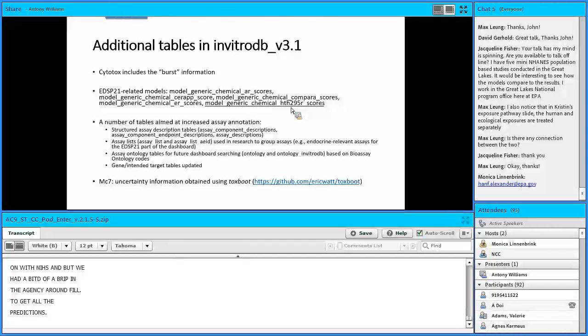And then finally, Tony mentioned searching for assays based on annotated gene. Again, Mahmoud Chaber and my team, very tedious and time-consuming work to sit there and hand annotate genes to assay endpoints, but that has been updated a lot. And I think it helps to have it in the database because if you're doing a bioinformatic integration of ToxCast assay data with Affymetrix data or data that you've pulled out of PubMed of any kind, you might use gene name as an identifier to integrate those data streams. And so that's also provided in tables within the database.